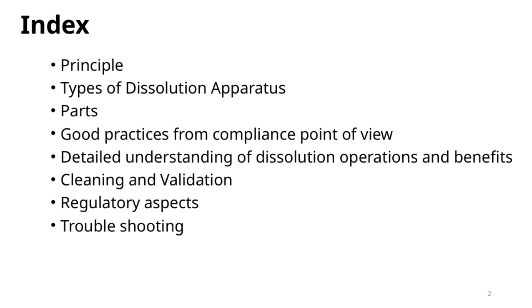A detailed understanding of dissolution operations is essential, so we'll cover the benefits of proper procedures and how they contribute to consistent product performance. Cleaning and validation are key to avoiding contamination and ensuring equipment accuracy, so we'll touch on best practices here as well. Regulatory aspects are always at the forefront. Knowing the guidelines and requirements helps us stay compliant and prepared for audits.